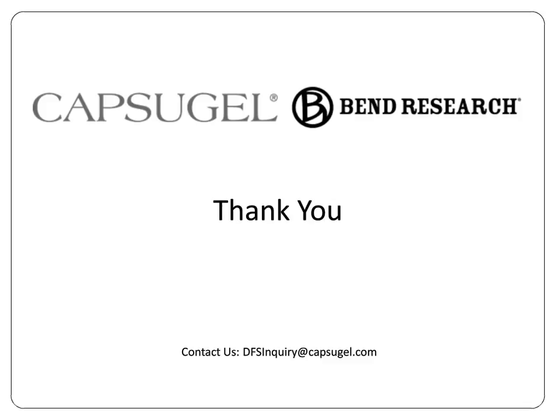Jeff, one thing to add to that is that all of the PAT technologies that we've presented today can be adapted to a disposables application, which obviously has benefits there as well.